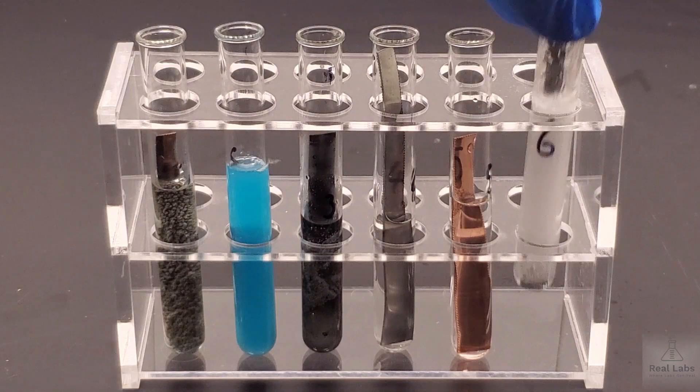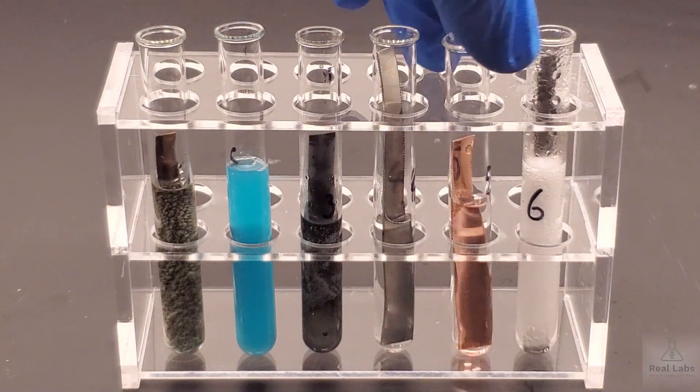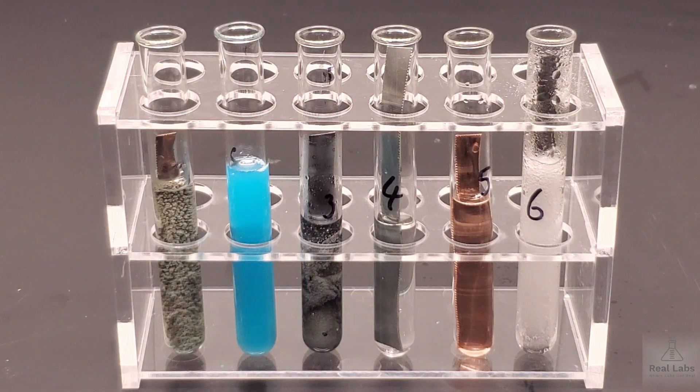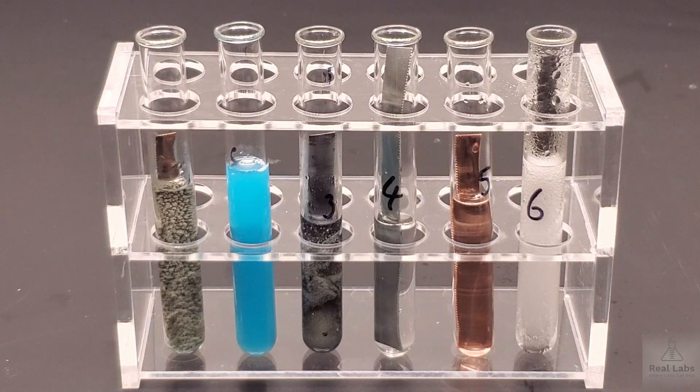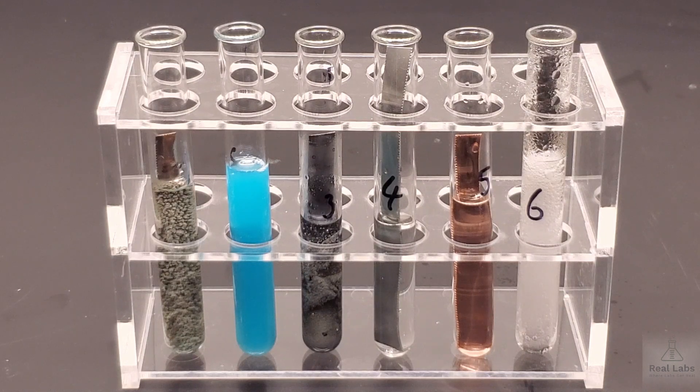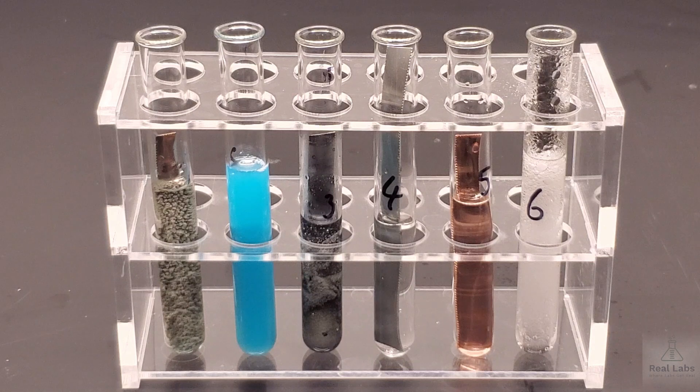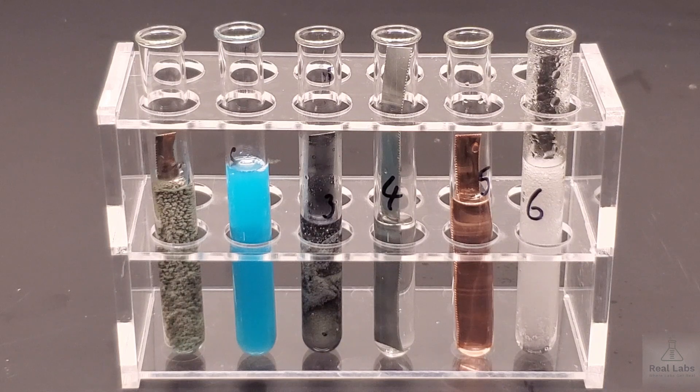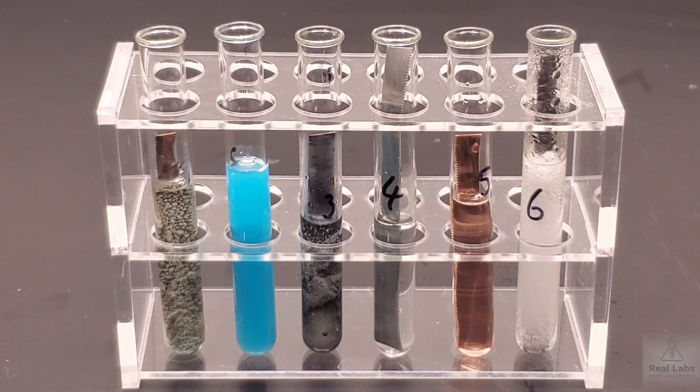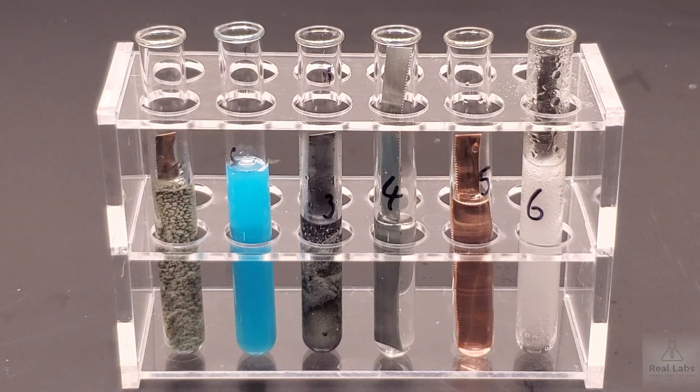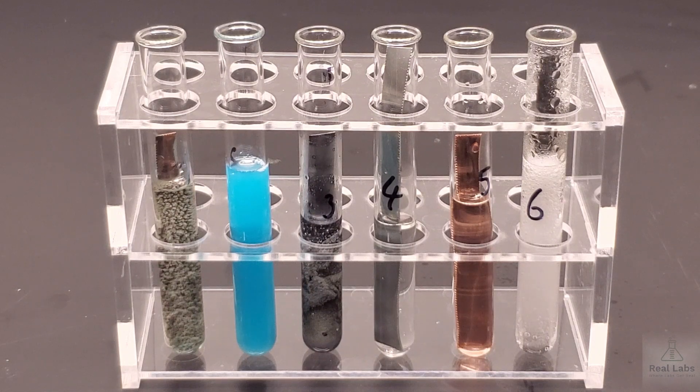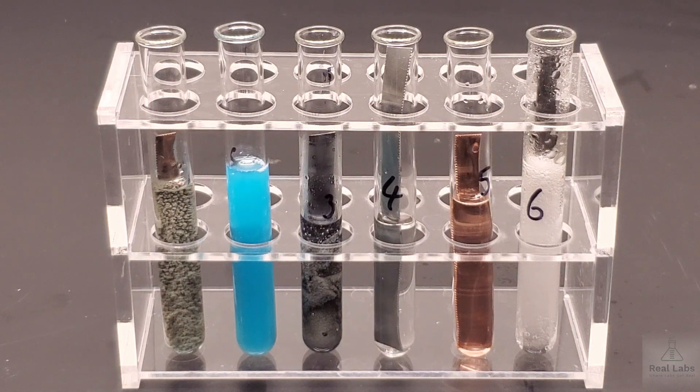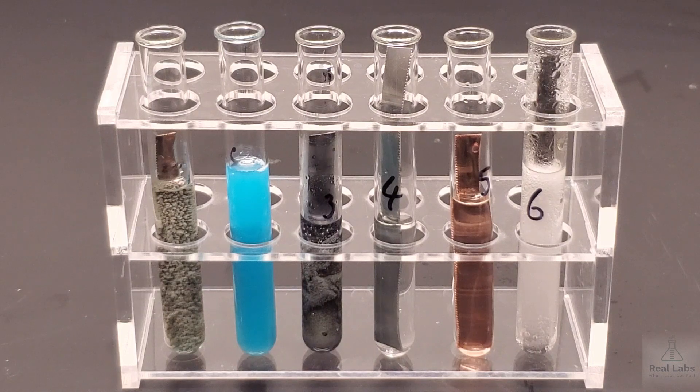Alright, so now you can make observations as to what happened in each of those systems, if there was a reaction or not, and what the observations were. From that, you should be able to determine what the reactivity sequence is for the metals that we're looking at here: silver, copper, lead, and magnesium. And of course, the sulfuric acid represents hydrogen, which we also typically include in that reactivity series. The full name of that series is usually the reactivity series of metals and hydrogen. It's often forgotten, we just call it the reactivity series. So hydrogen is in there. When we use sulfuric acid, we're really considering that as a source of hydrogen ion. Alright, and at this point, you should be able to finish the rest of your lab.